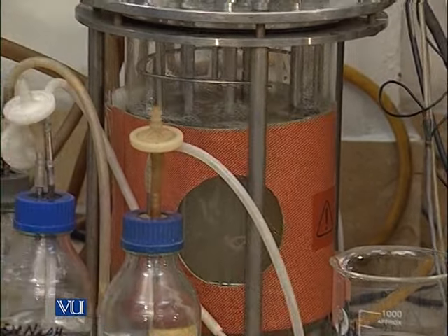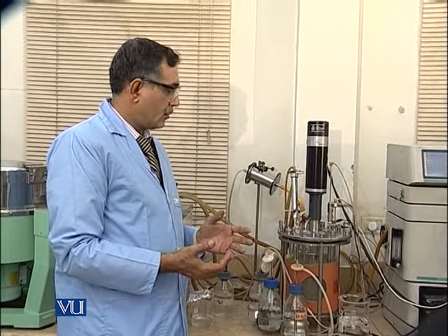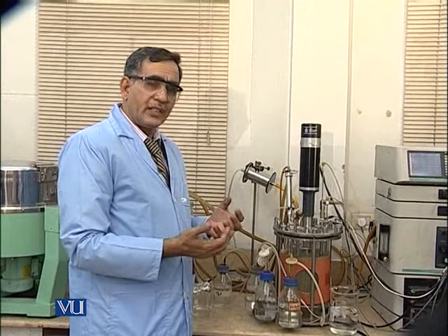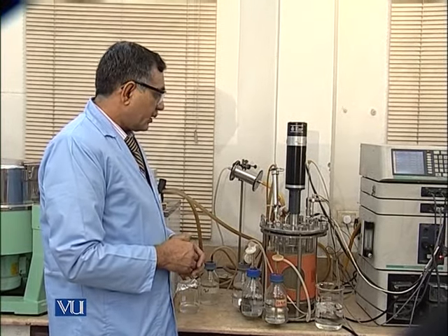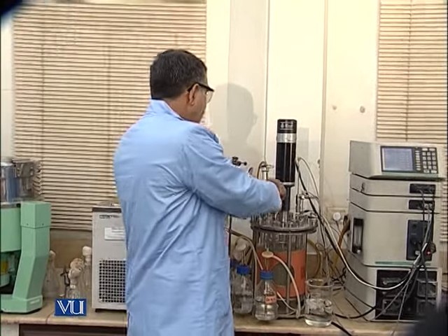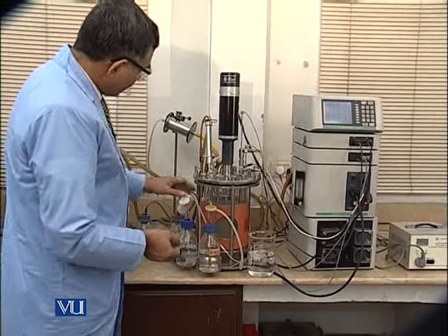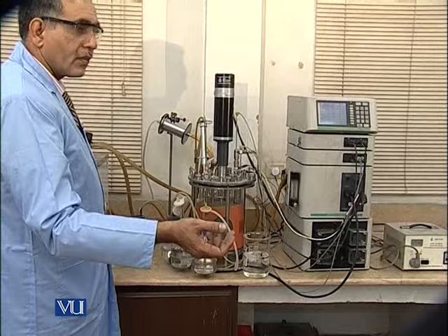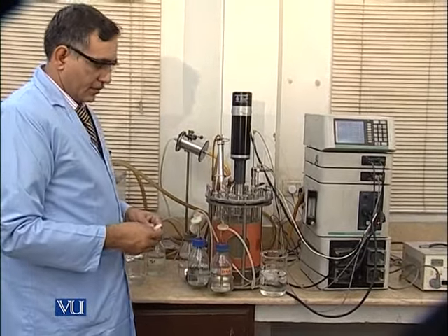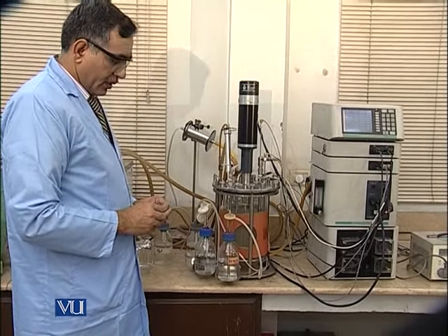After the inoculation, we will give the proper incubation time, and gradually we will take out the samples. For the sampling, we have to take the material gradually at 0 time. At the start of the fermentation, at 0 time, we will take the sample.